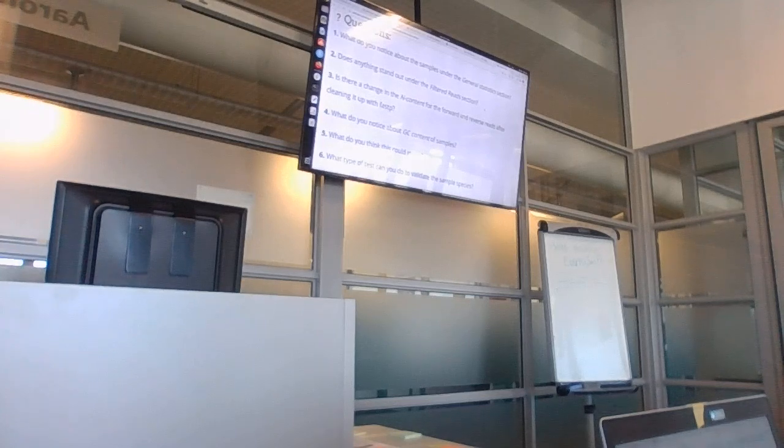Then you have to just say, so it will just generate two choose. So if you click right, then it will give you one each. You can see in one JPEG. So you see that you just usually figure that way. Yeah, so that's the each. You can choose which one. But obviously if you didn't tick that, it will give you that.